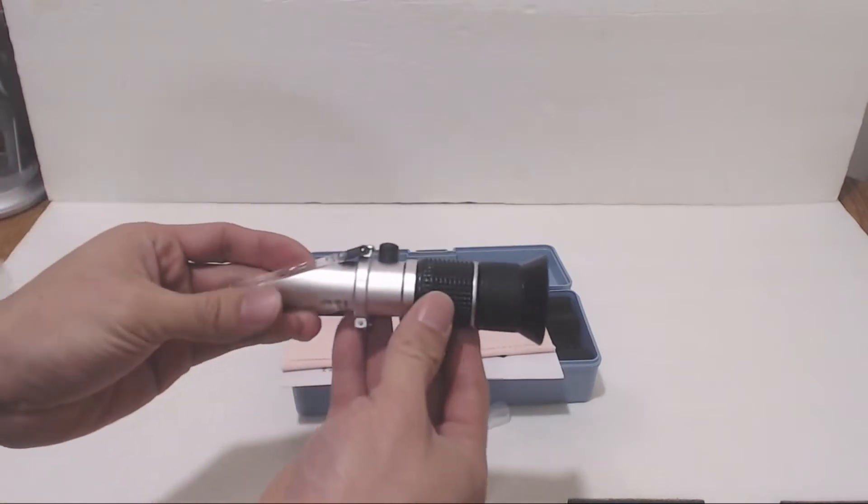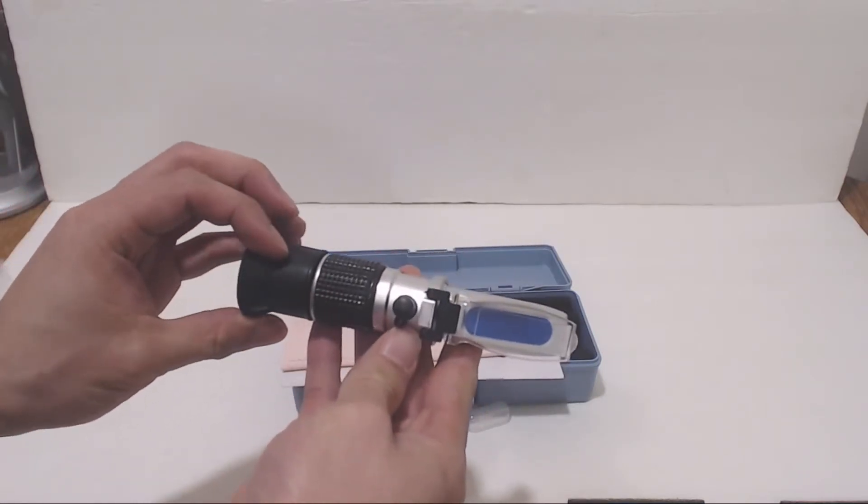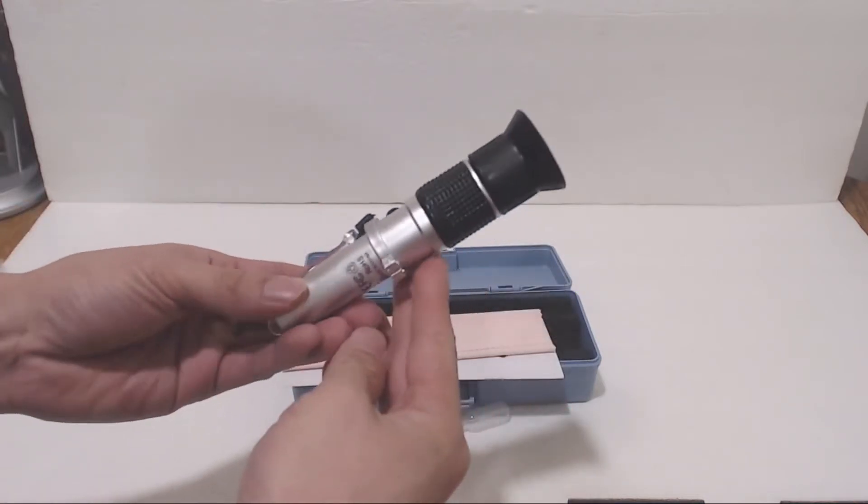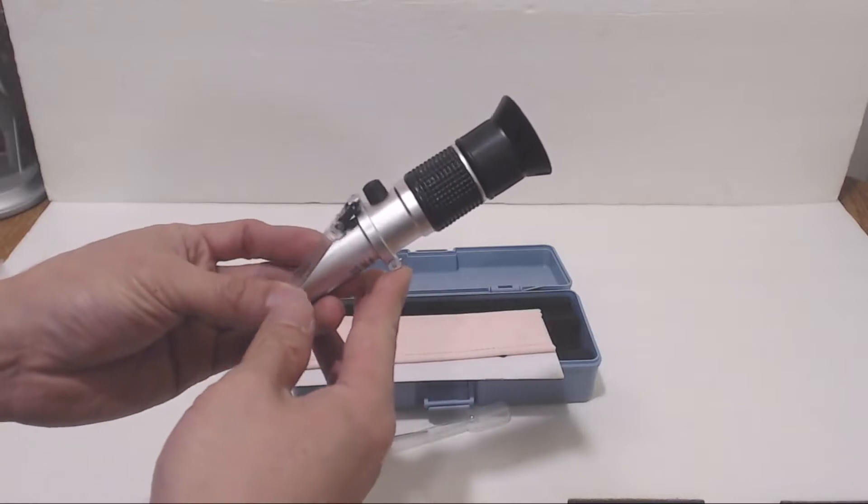The refractometer is a tool that can measure the sugar content of a liquid using a scale called Brix, which is the amount of dissolved sugar in an aqueous solution. So 1 degree Brix basically means the solution is 1% sugar.